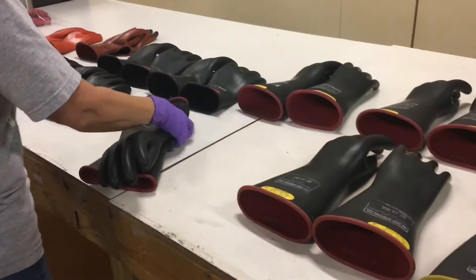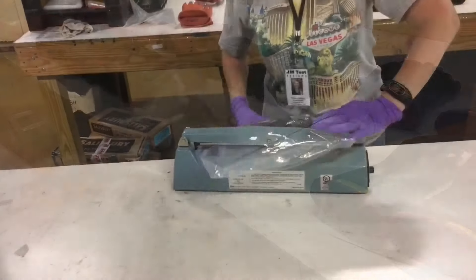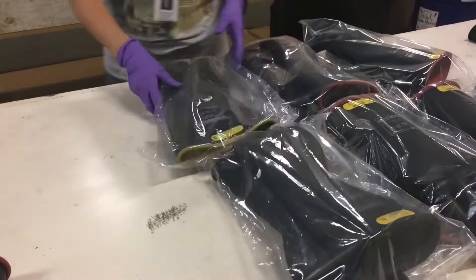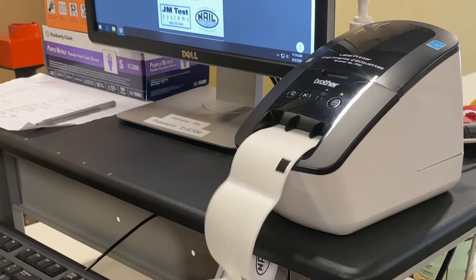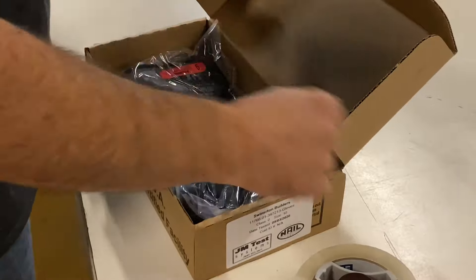For easy identification, each pair of gloves is packaged in clear bags then heat sealed. The heat seal allows customers to know when a pair of gloves has been issued out for service. Labels are applied to boxes to easily identify contents without having to open each box, making for easy distribution back to employees and storage.